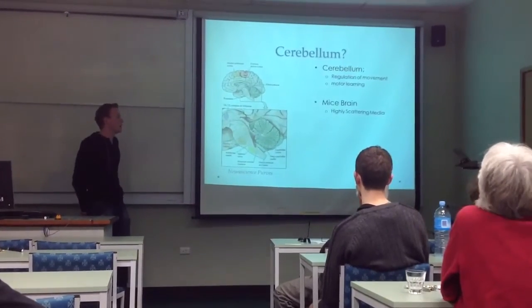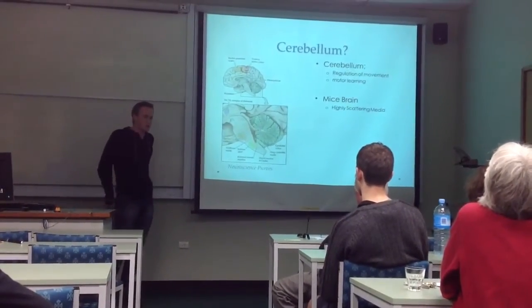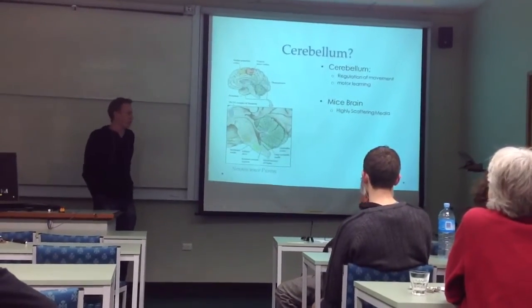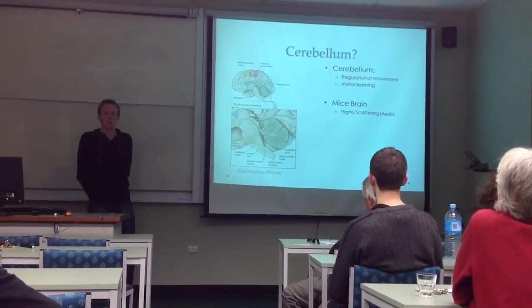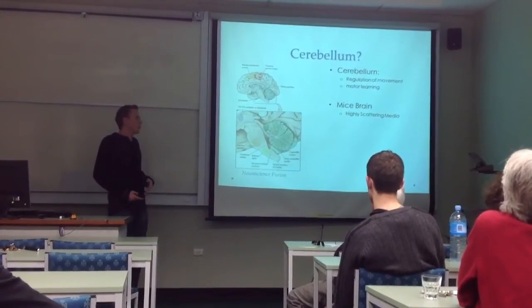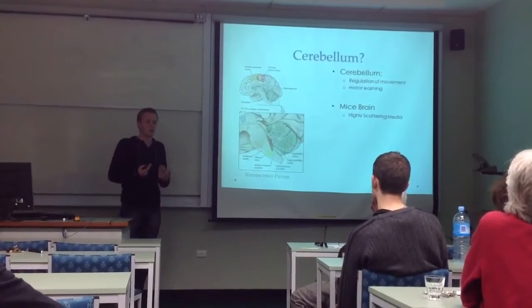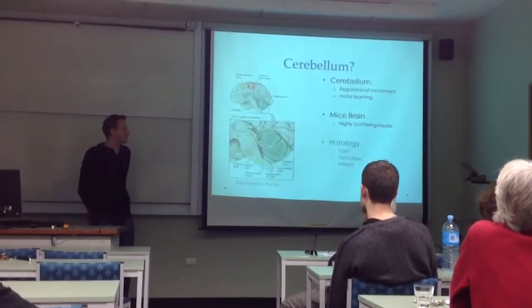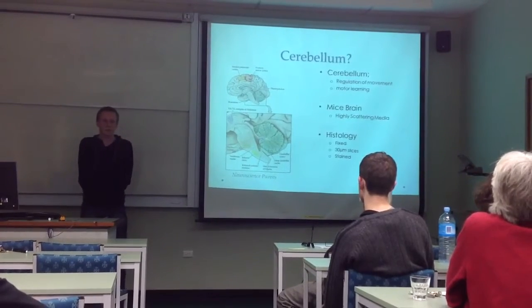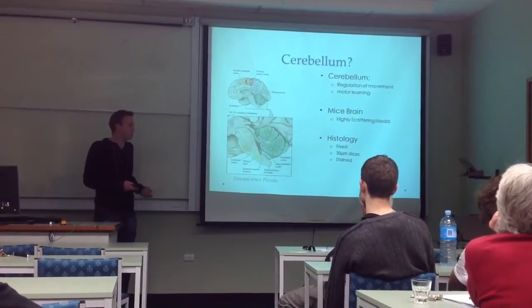So I thought I'd explicitly say that I'm not using human brain, I'm using mice brain. There are a lot more of them around, but they are a highly scattering medium, whereas OCT was originally developed for ophthalmology and transmission through a transparent medium. And I'll establish what's currently used to get the morphology of cells.